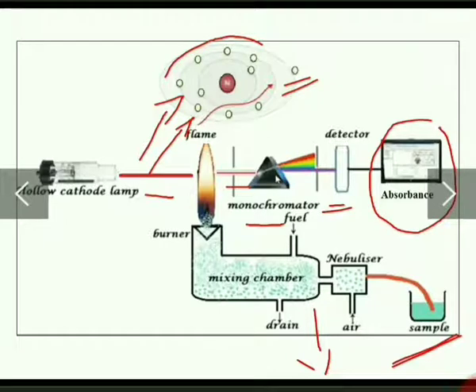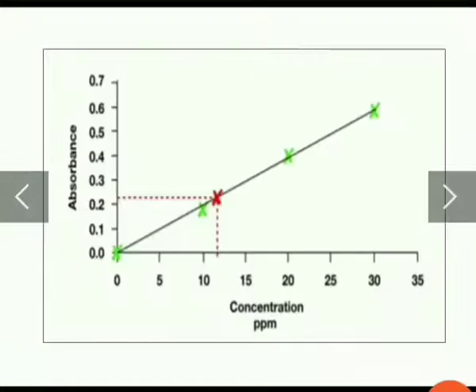Here it is measured as absorbance. So it is understood that as the concentration of sodium increases, the absorbance increases and the transmittance decreases.